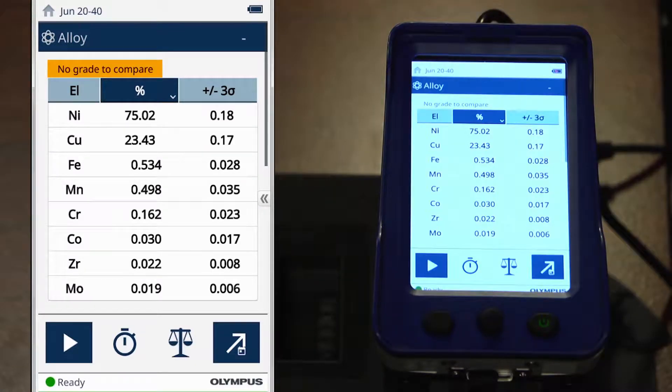As you can see, no grade to compare has appeared across the top of the screen. Let's take a look at the chemistry to better understand what might be going on here. We are clearly analyzing a nickel alloy, so why didn't we get a match?